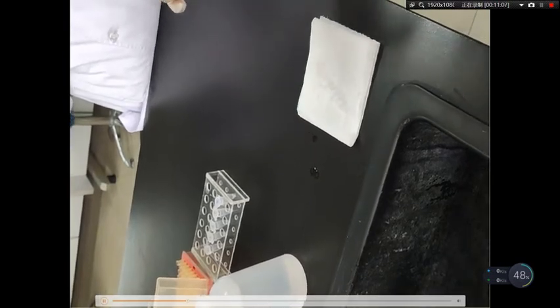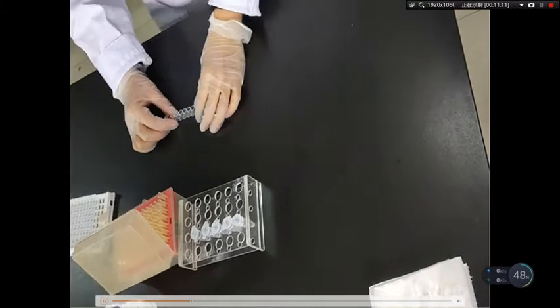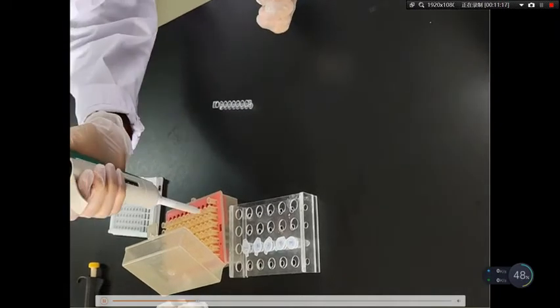After 2 additional washes, we add 100 microliters of enzyme labeled secondary antibody to each vial, except the blank vials.